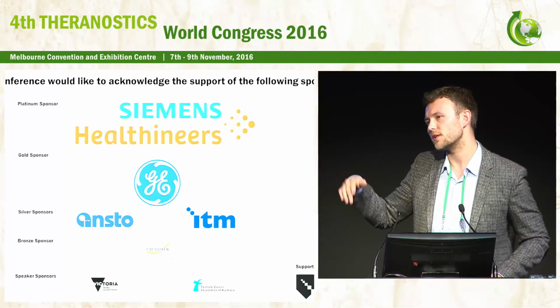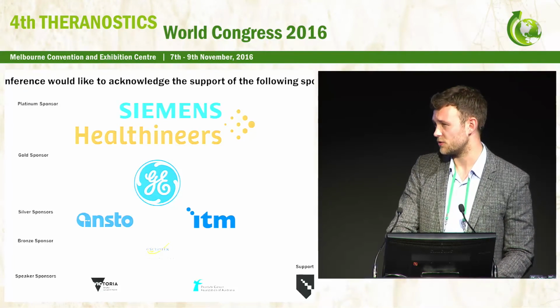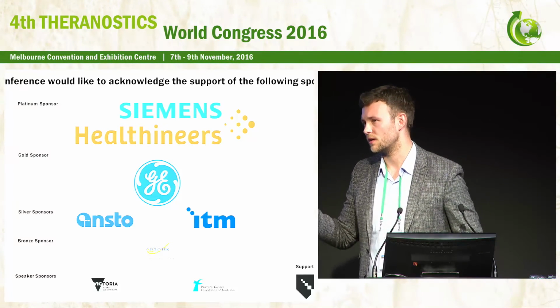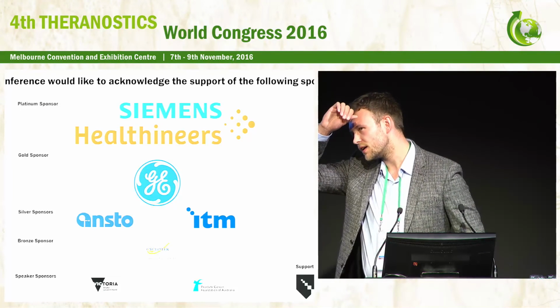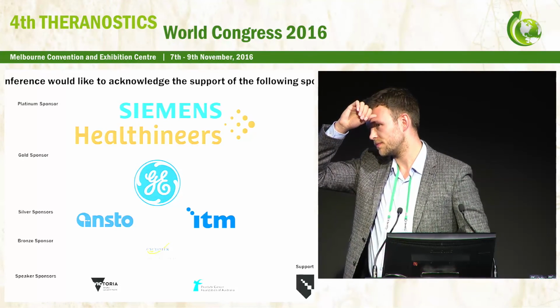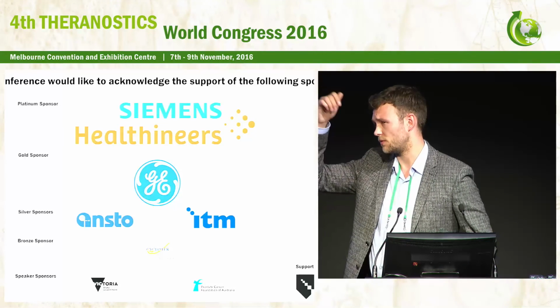All these forms, with chlorocomplex or with the gallium tetrahydroxy anion, move with the solvent front every time. Tetrahydroxy is not formed. Sorry? In this pH range, tetrahydroxy is not formed. Only the 2-hydroxy and mainly 3-hydroxy species. Tetrahydroxy only at pH up to 8. Yeah, but this form moves with the solvent front every time.